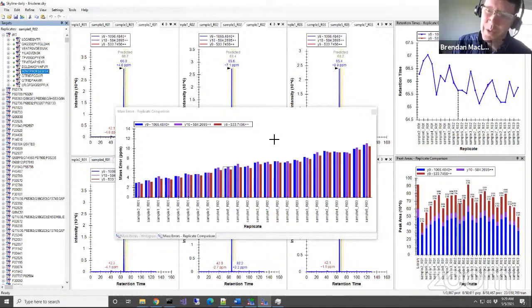So it's all a matter of prioritization and who we have doing the work. Certain developers really like working in certain areas, and you have better efficiency if you can give somebody like Brian Pratt ownership of ion mobility and small molecules, so they spend a lot of time on those, and I'm not going to disturb them to throw in a feature for something else. So it's a live person management feature implementation problem. But yes, we recognize that recalibration would be useful, and it's on the list.